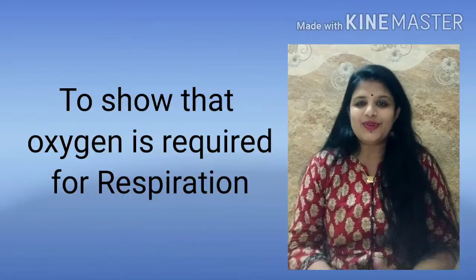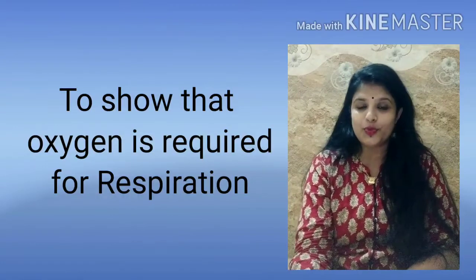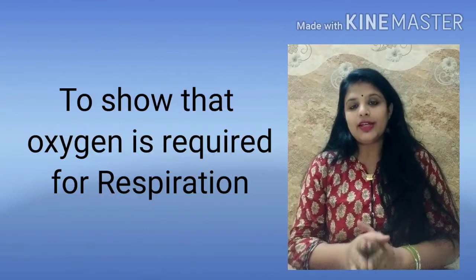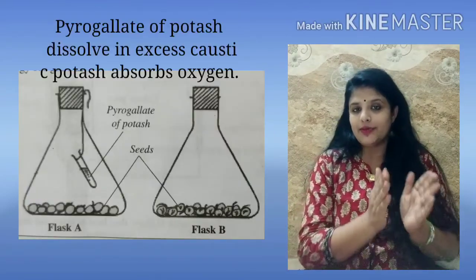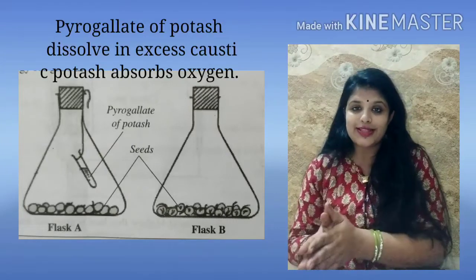Hello. So we are here with another experiment, and in this experiment we are going to prove that oxygen is required for respiration. Again, we will take two setups for a better comparison. In one of the setups we will take germinating seed. In another setup also we will take germinating seed.